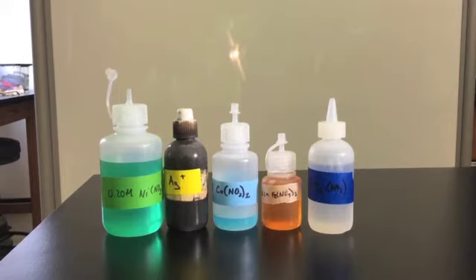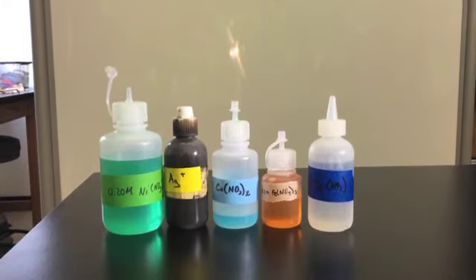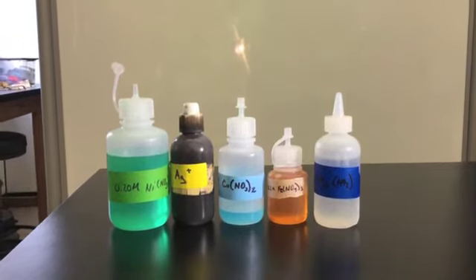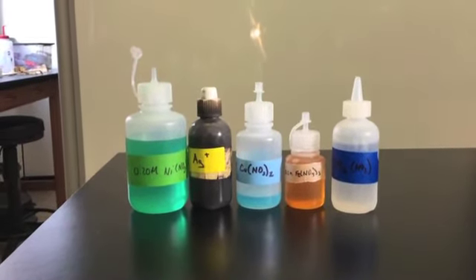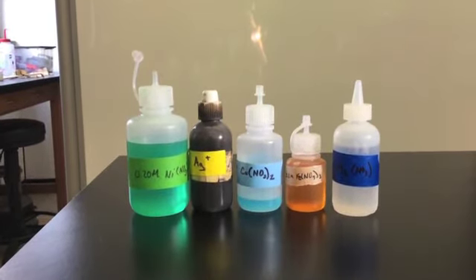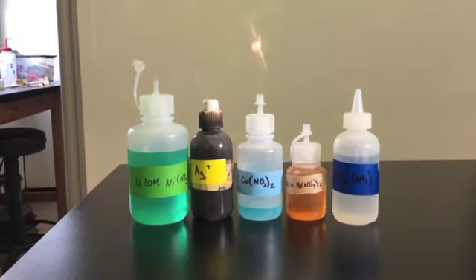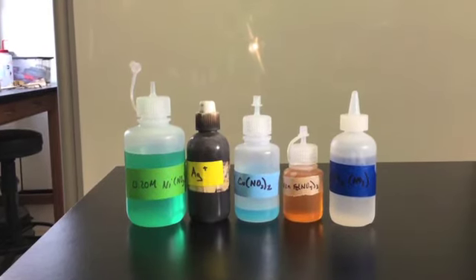These are the ions that we will be testing for in this portion of the lab. Notice that in some cases we have labeled with the actual chemical in the bottle, for example nickel nitrate, and sometimes just the ion. All of these are nitrates of the particular ions. Remember from your solubility rules that nitrates are always soluble, and this is the easiest way to make sure that when we combine these into one solution, the anion from one does not cause another to precipitate. Please take note of what these ions are and the color of each before proceeding on to doing your observations of the lab itself.